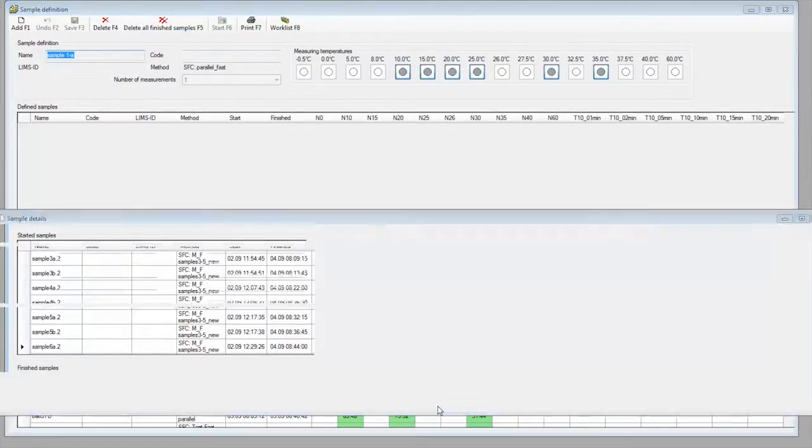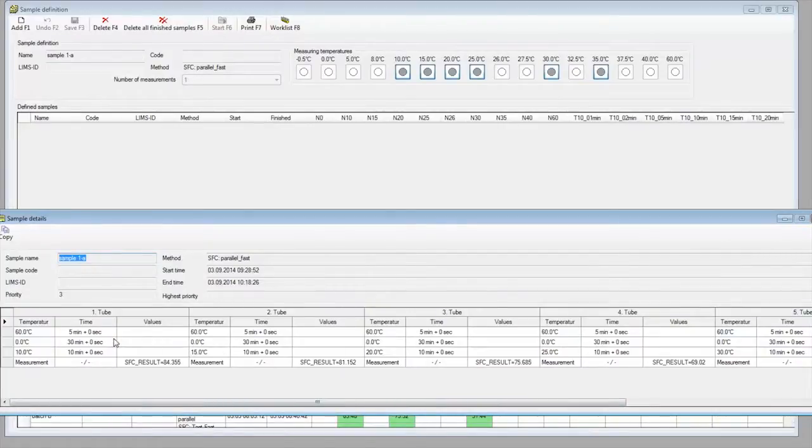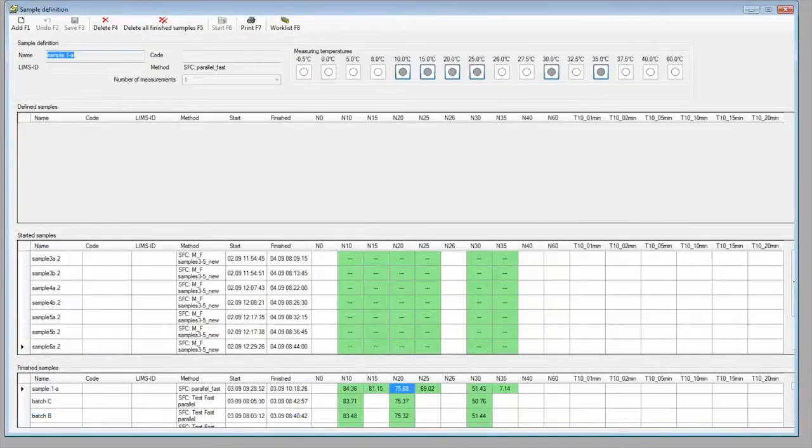The details of the method, including the actual times, can be checked. Older samples are archived for data tracking. After measurement, the sample can either be returned to the output tray or discarded via a waste line.